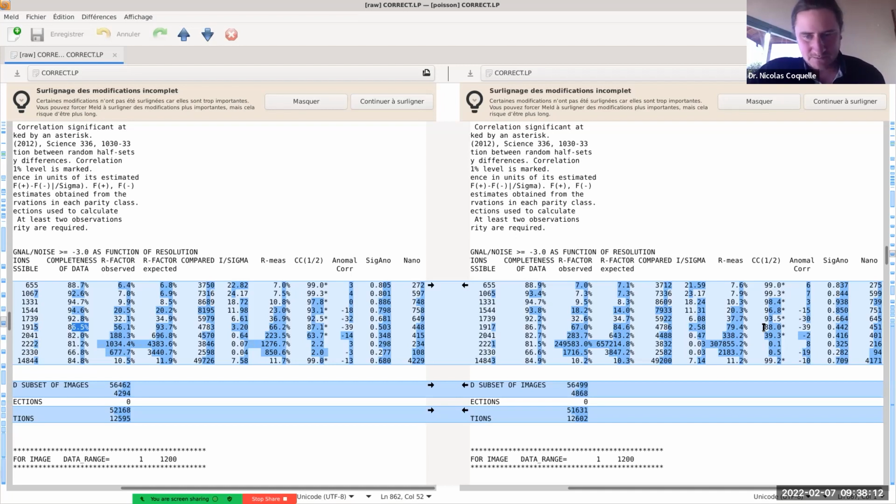What we have in our hands, not from Jungfrau but still this data from Eiger, is data which can be phased. If we can show that with a minimal number of images which can be phased, and we go through this classification, re-identification, and we can still phase, I think that would be a nice validation of the procedure. So that's what needs to be done next with our test data.